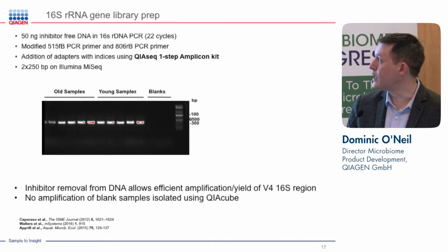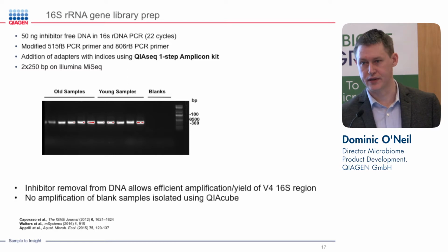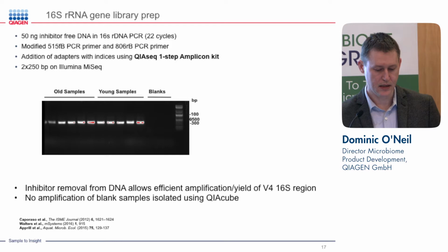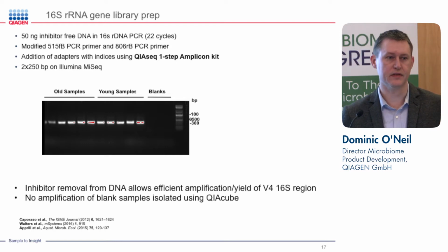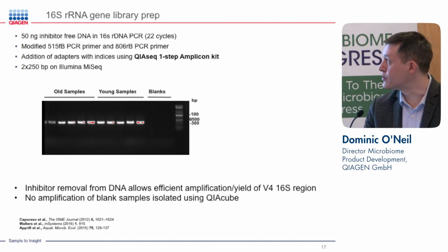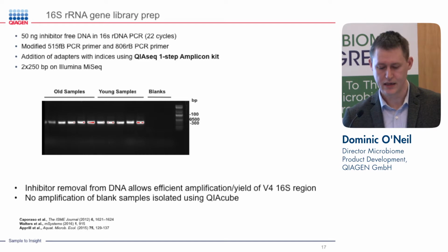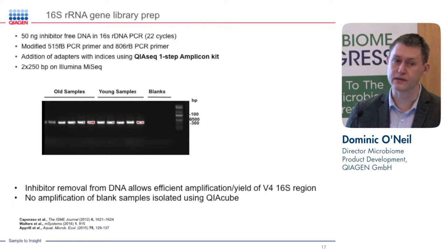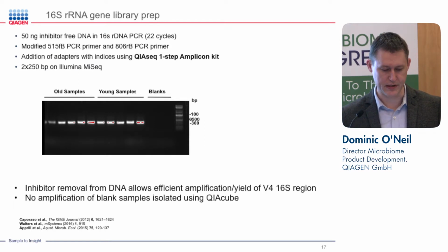One thing that I want to point out about this is that there's the 2 samples there that are blanks. Those are actually water samples that were run on the QIAcube with the same kit and then also subjected to the same 16S PCR. We did that as a control to make sure that we're not getting any cross-contamination coming off of the QIAcube, as well as no contamination coming through our samples or through our PCR reagents. You can see here that we have no amplification in the blanks, so we can be confident that we have nice, clean results and only amplified the sample that we're interested in.